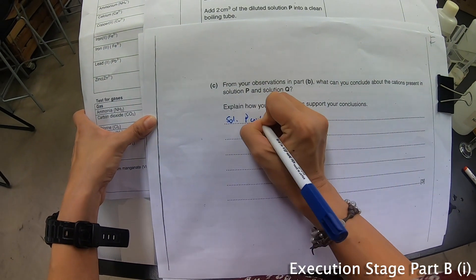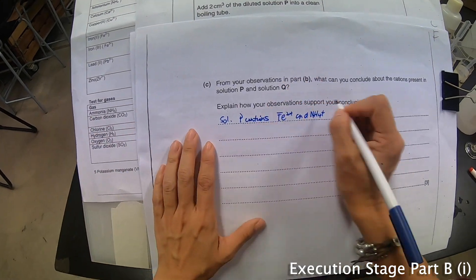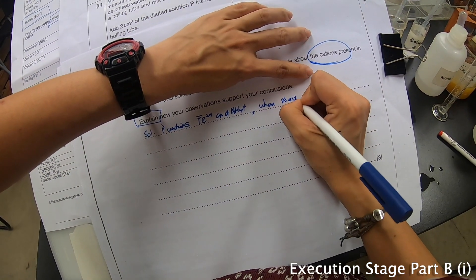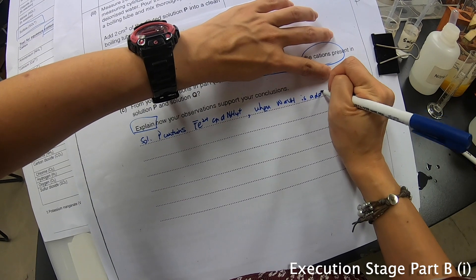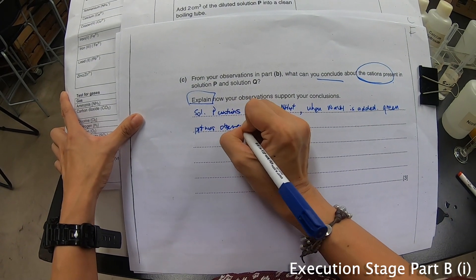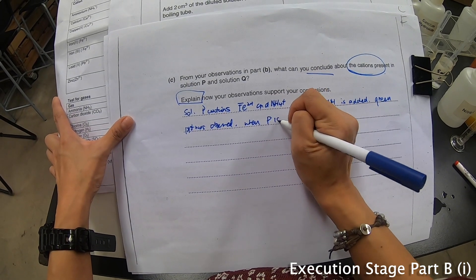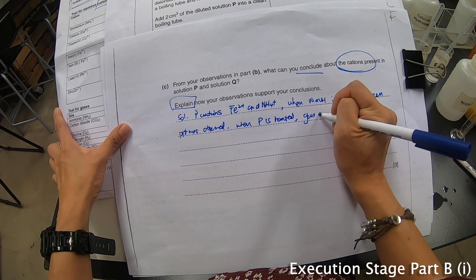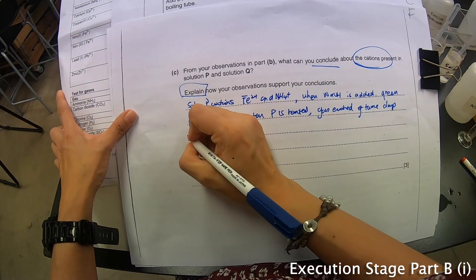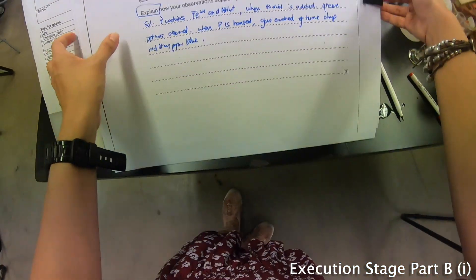Solution P contains Fe²⁺ and NH₄⁺. Those are the cations I conclude. Explanation: when NaOH is added, a green precipitate was observed. When P is heated, gas evolves and turns the damp red litmus paper blue. That completes this part.